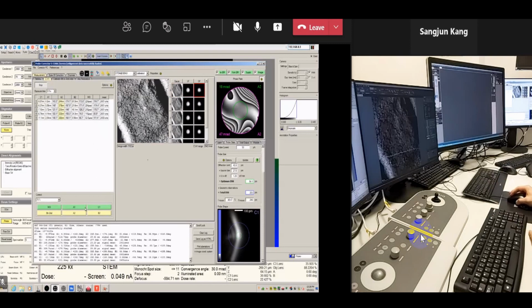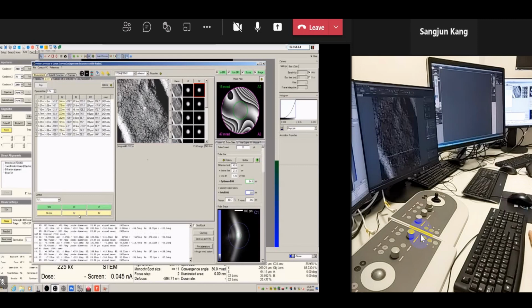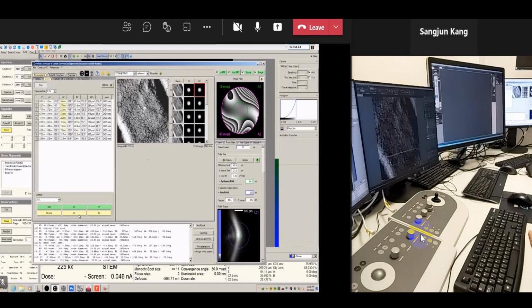A2 has a problem right now, so we correct A2. It still has a problem. I think today's video can be very, very short, shorter than I expected.